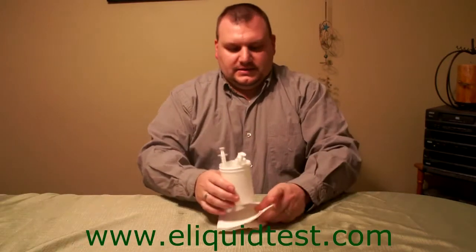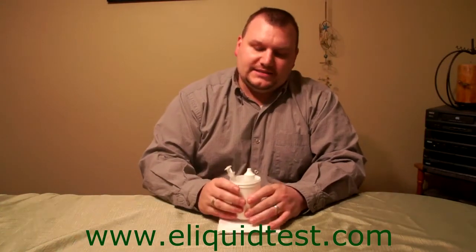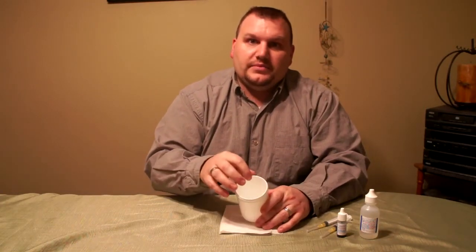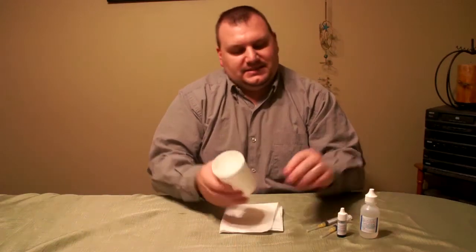For supplies you can go to www.eliquidtest.com and get the test kit. Basically what it includes is your test chemicals, which are your 0.12N sulfuric acid and your bromothymol blue. You also get a white plastic cup. It's really good to use a white cup because you can tell the blue to yellow color change a lot easier. You can use a clear glass on a white background or a white piece of paper, but it's harder to tell. With a white cup it's nice and easy.